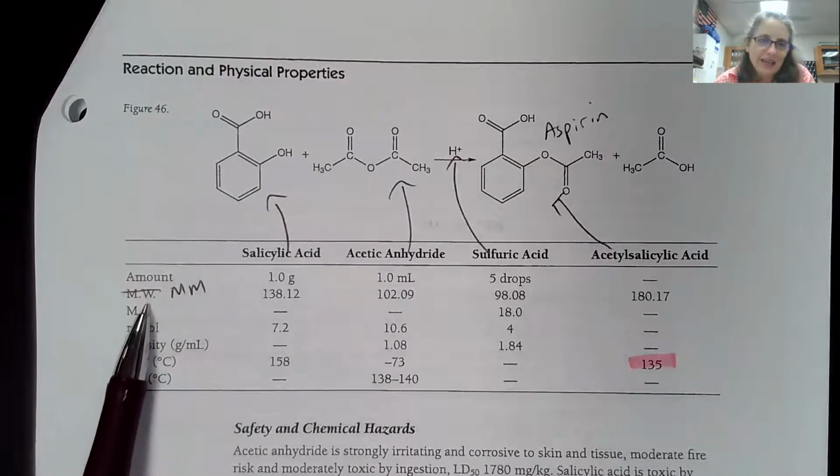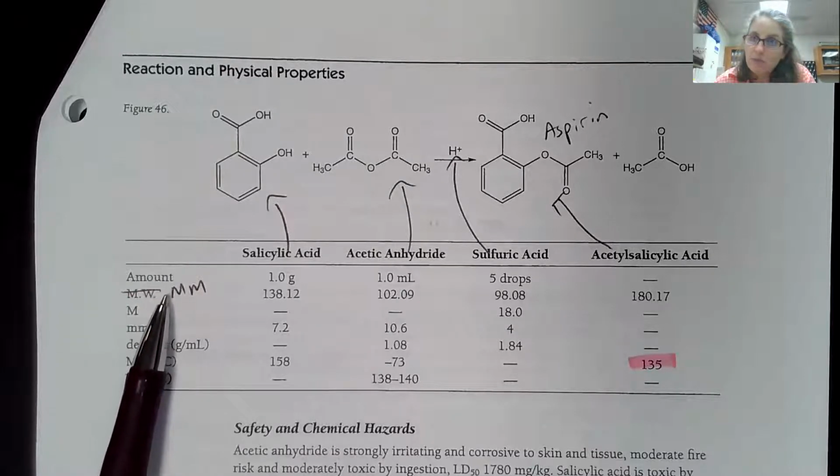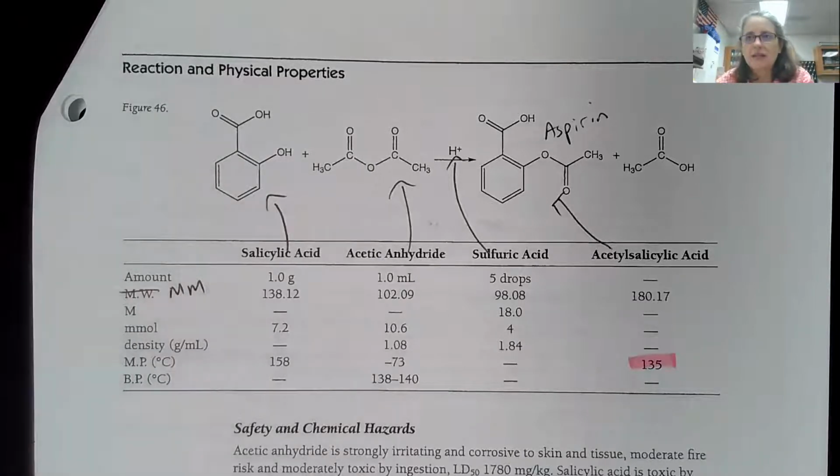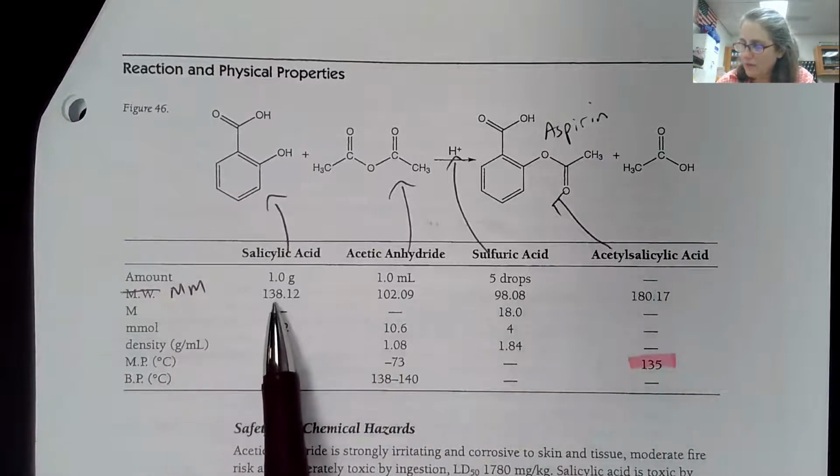I do realize that a lot of books have MW, which means molecular weight. We have been using molar mass. It means the same thing. Technically there is a difference, but if you do see that, that is what the reference is.